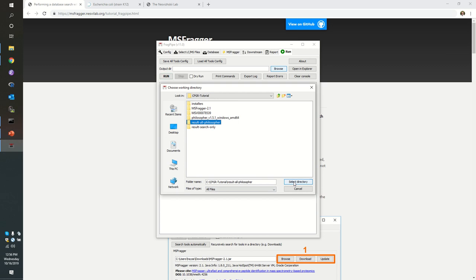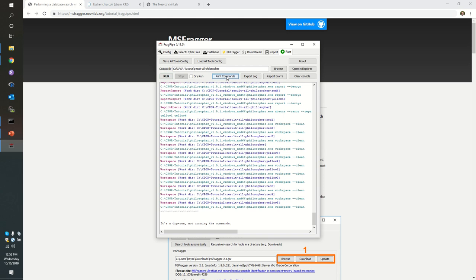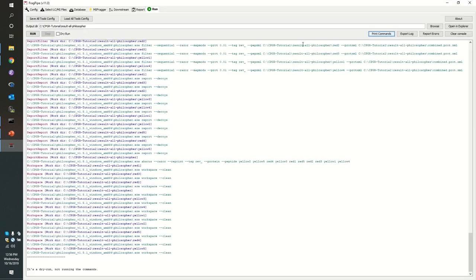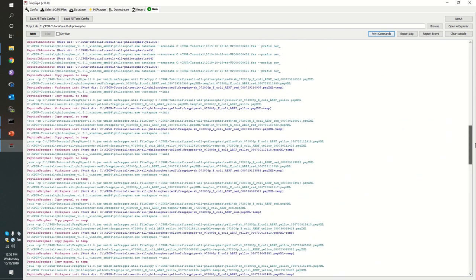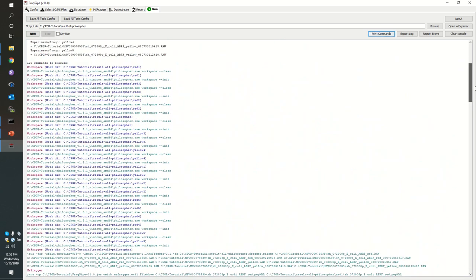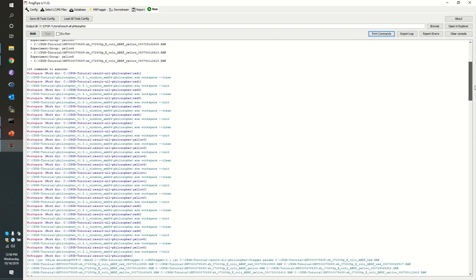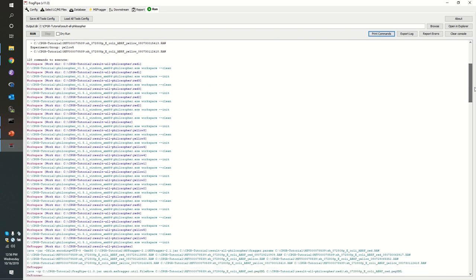We've named our directory result all philosopher. And now I'm going to select that directory as our output. Once again, I want to print commands to show me just what I'm in for. Now before, we had a relatively short list of things that we were going to do. We just needed to launch a total of 11 commands, but look at all this stuff. We have 128 commands to execute here.